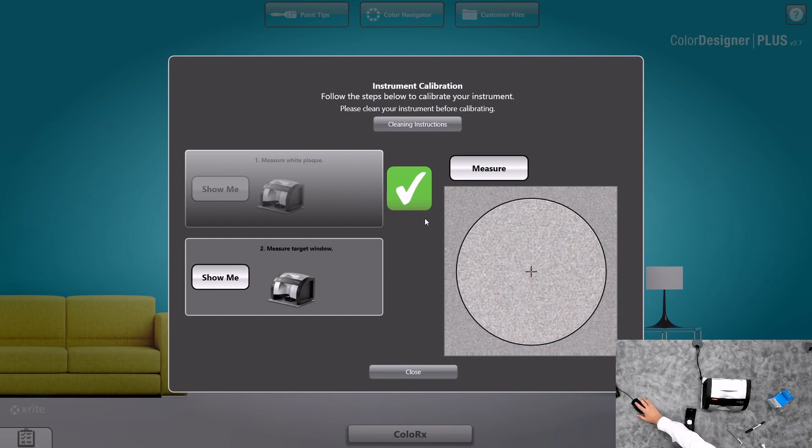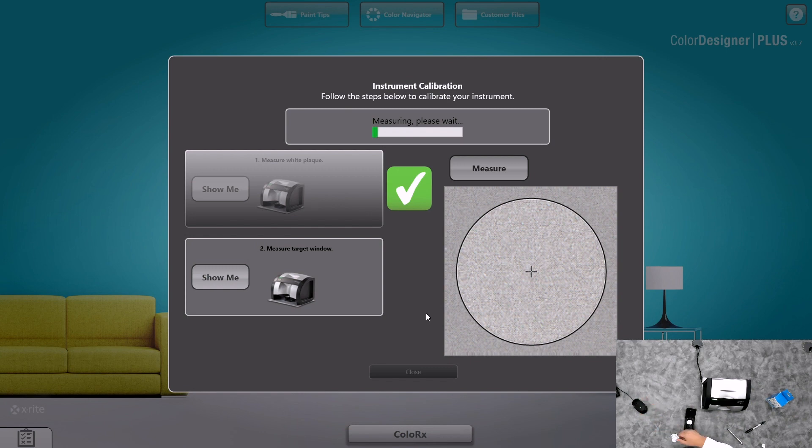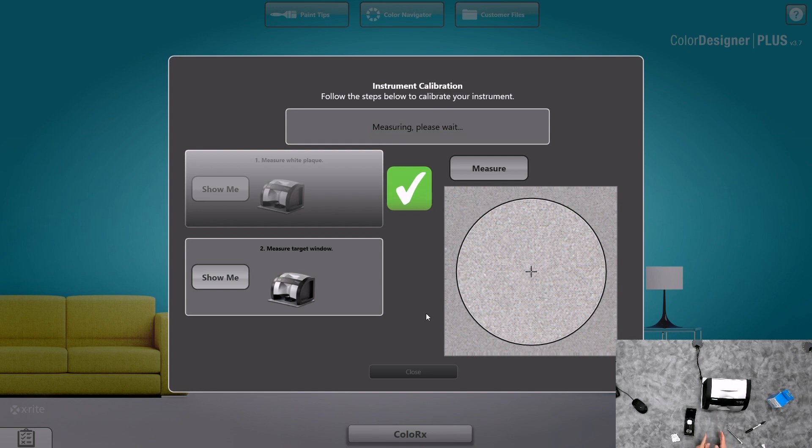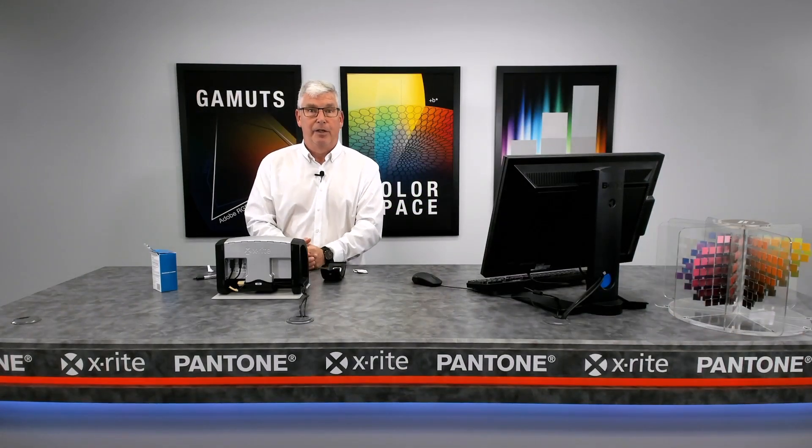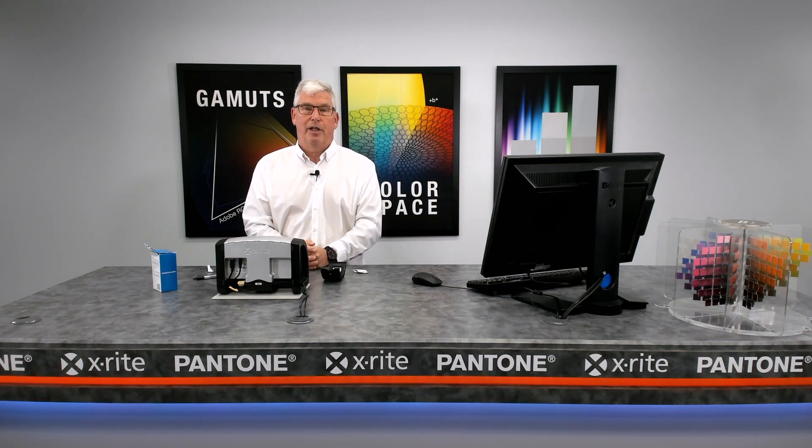Once that's complete and we have the measure button, we're now able to click on measure and complete the process. It's very important that the calibration plaque hole is visible to the camera, and that your tabs on your target square are completely clean. Thank you for your time. Keep the instrument clean, and if you have any questions, call our Match Right customer service line. Thank you.